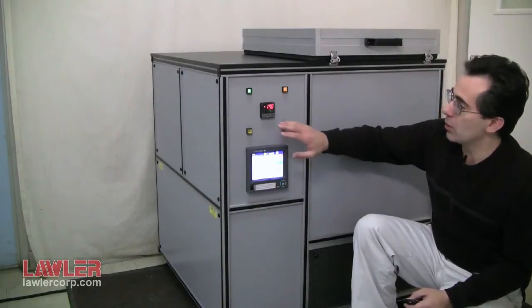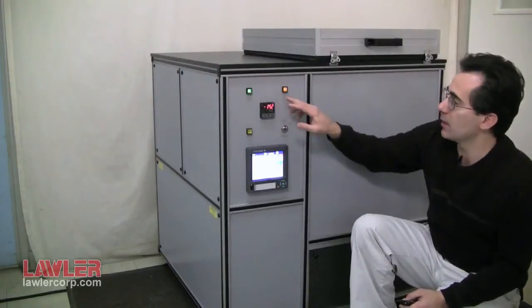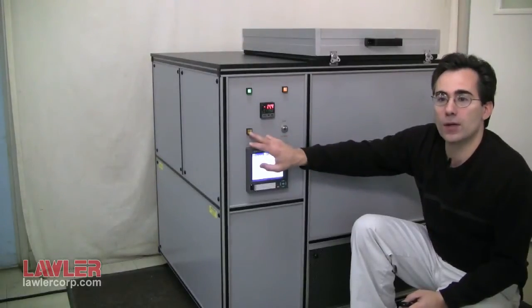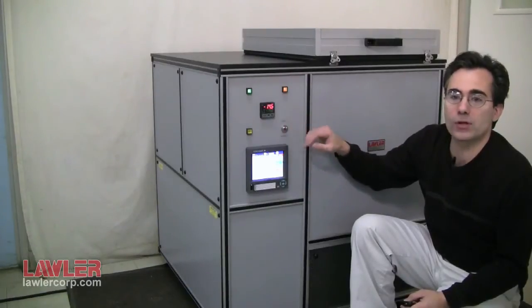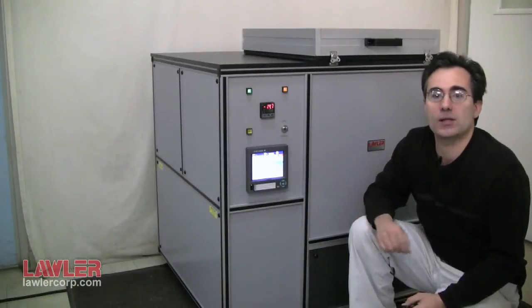There's also a series of buttons here. You have the main power for the instrument, the blower on and off. This is for turning on the torque motor. And then this selector switch is for forward and reverse of the motor to put the tension and compression, depending on the test method.